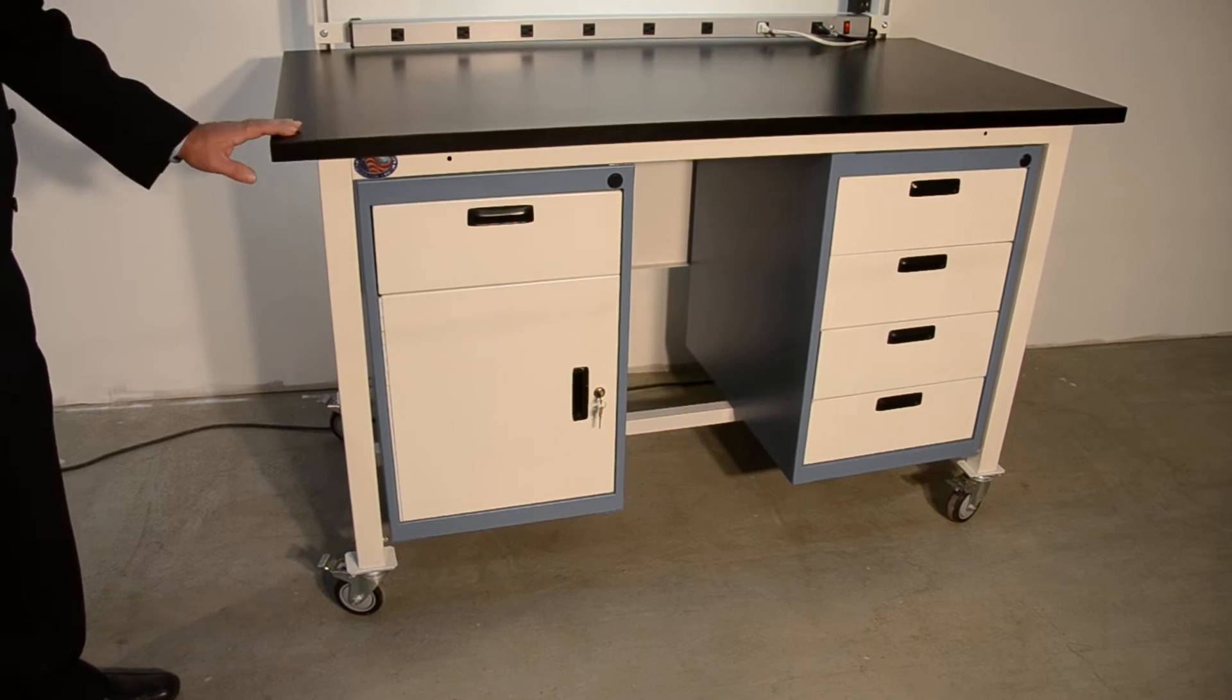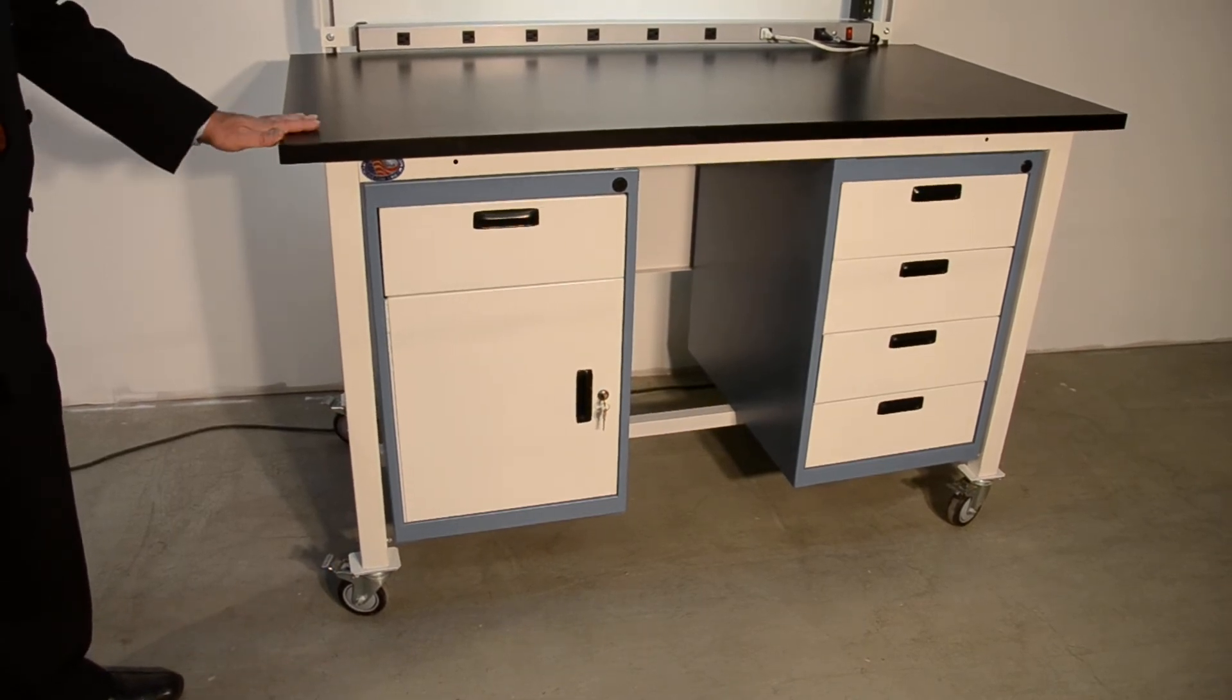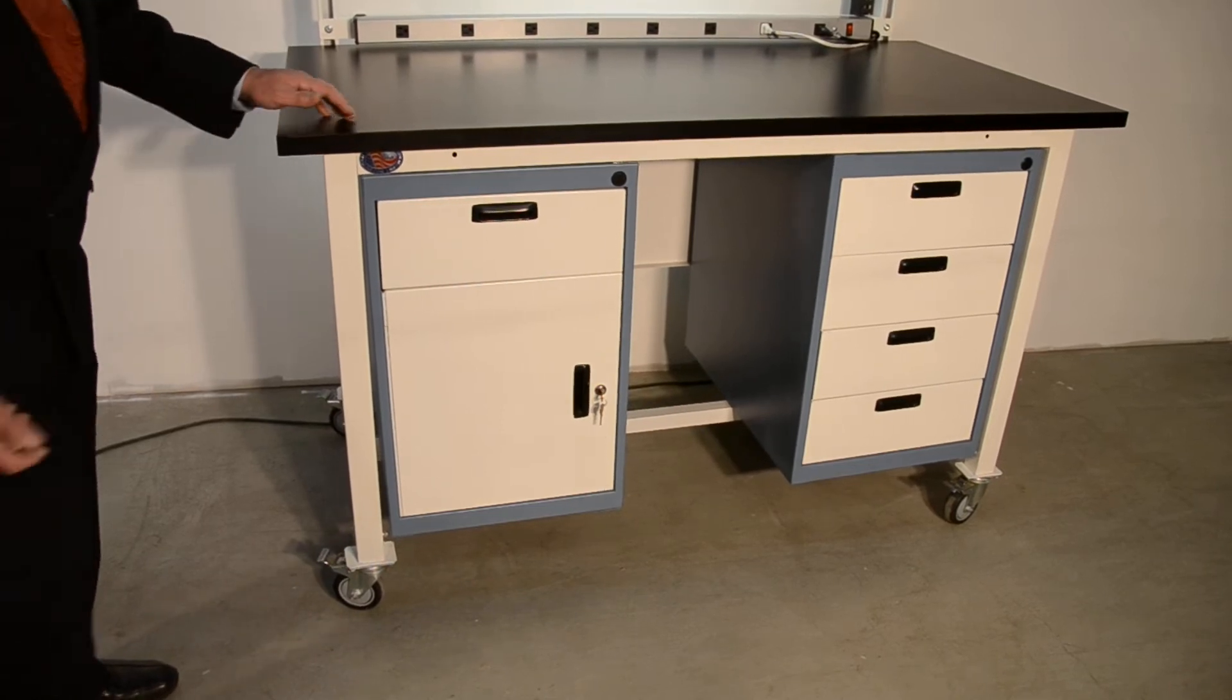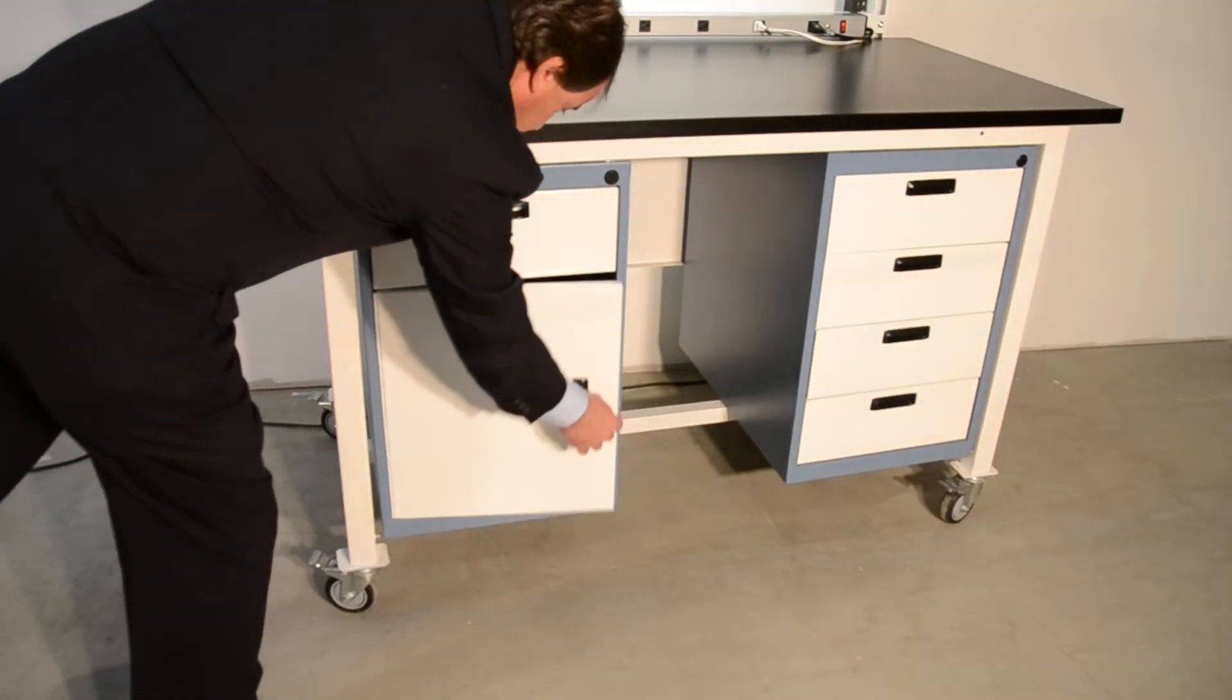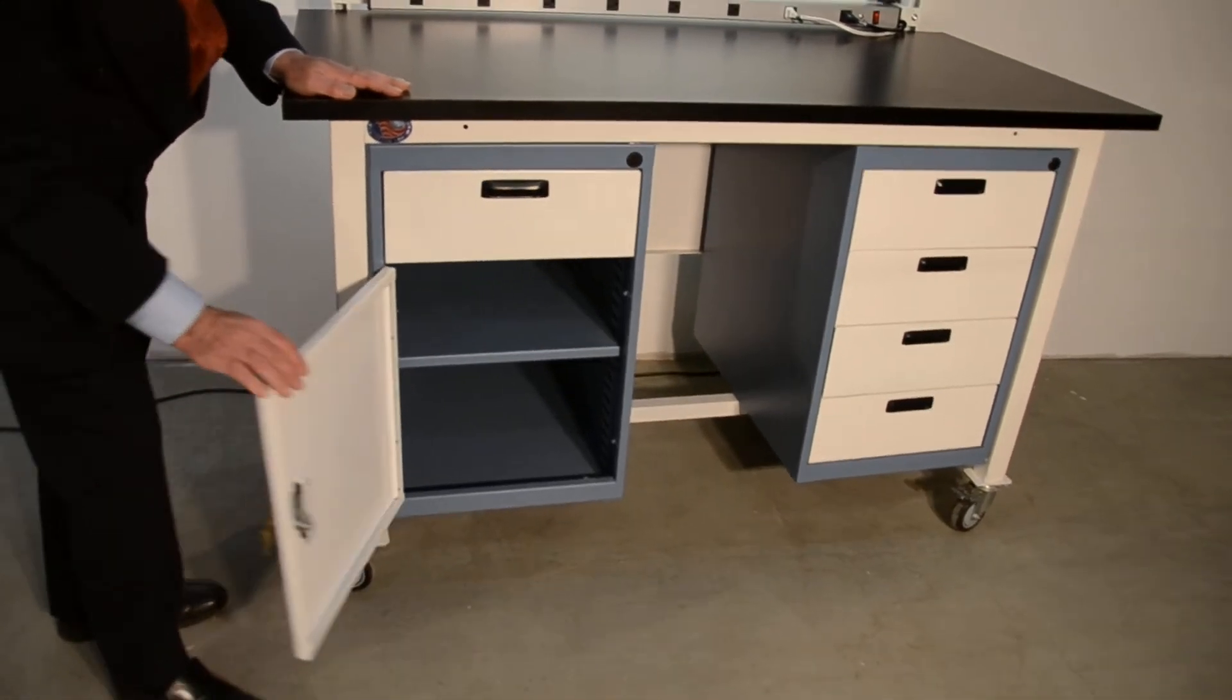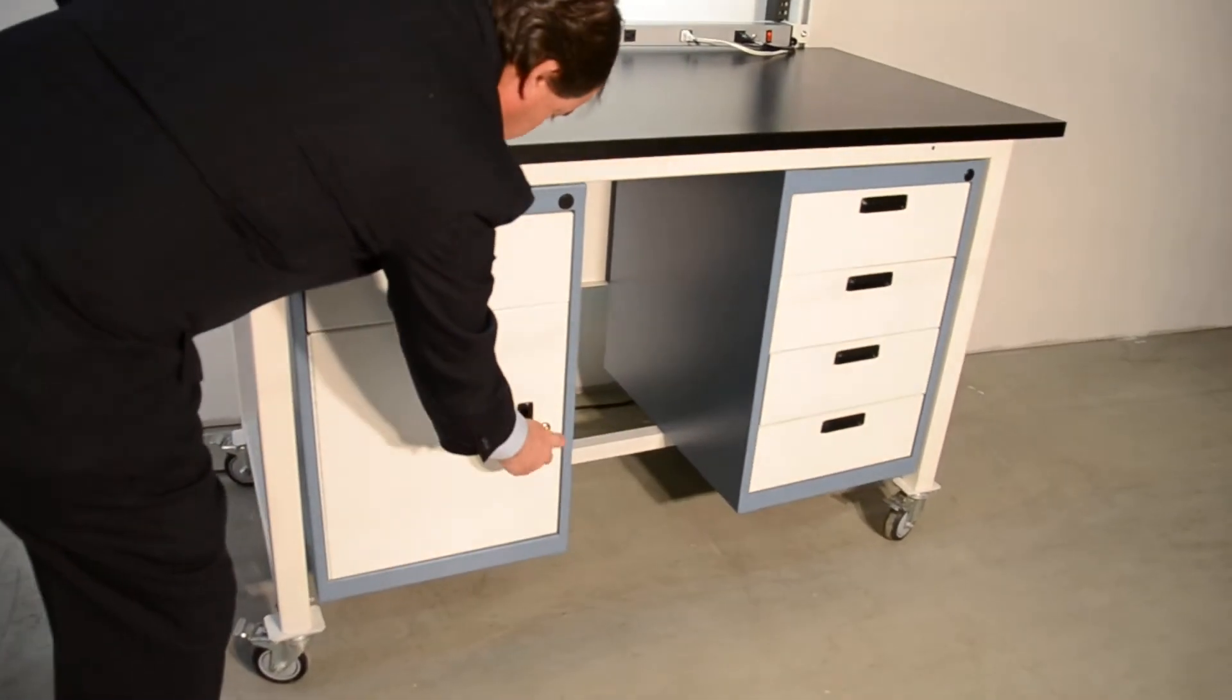As you can see, we're featuring a two-tone, textured white, textured blue on this. Recessed handles, swing door with lock. There is an adjustable shelf inside that can be set anywhere on one inch increments. The lock is included in the price of the cabinet.